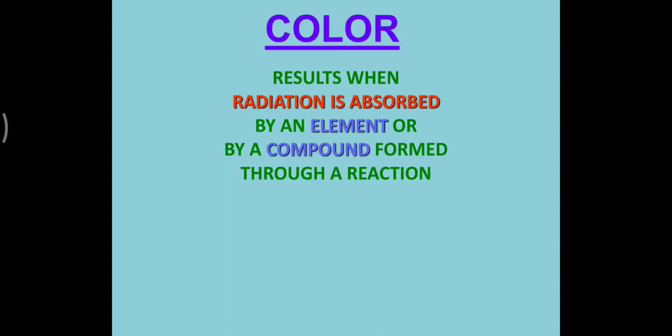The color of the solution is due to the formation of complex particles, or complex ions, present in the colored solution. They absorb the light whenever light is passed through that colored solution, so that we feel that it is colored. Though we see the cuprammonium sulfate solution as dark blue, actually it is not its own color, because whatever color we see is the complementary color of the color absorbed by the particles in the solution. That means if a solution looks blue, it may have absorbed some other color before appearing blue. We'll understand that later.